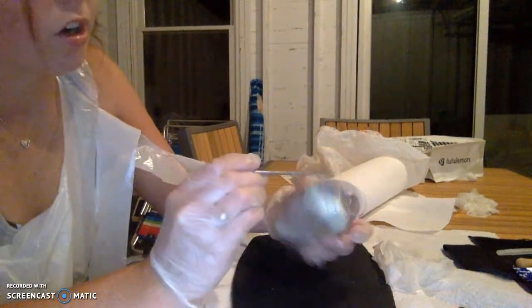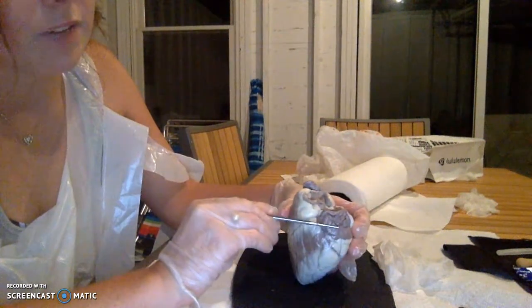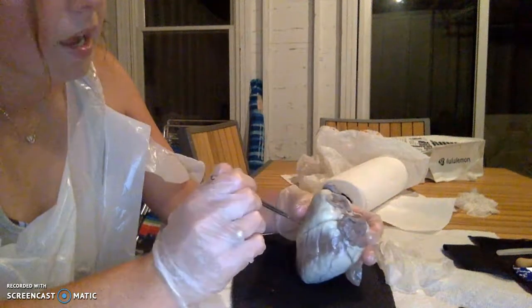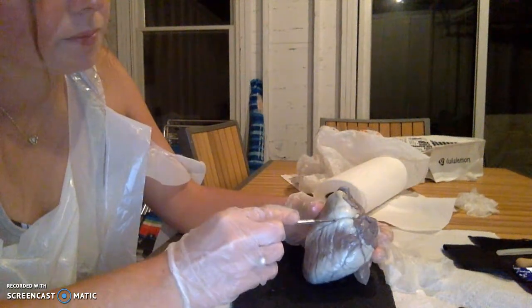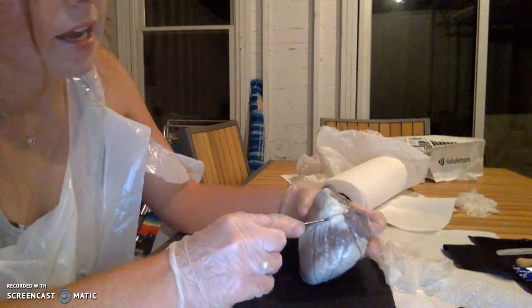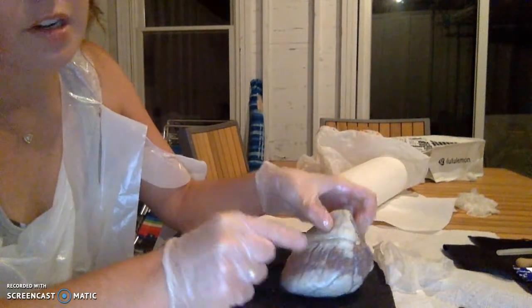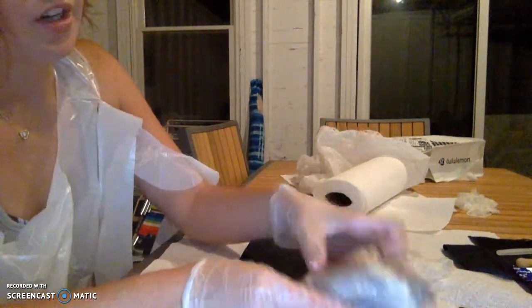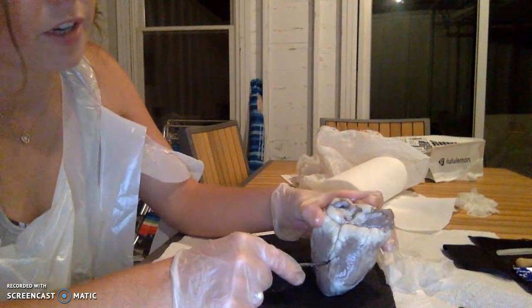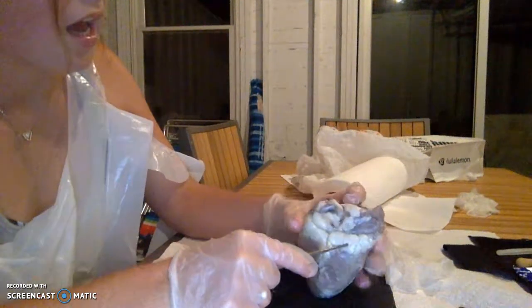And a little bit about, and here is the right auricle, here is the left auricle, the aorta is here, and the anterior interventricular sulcus is right here, and the posterior interventricular sulcus is right here. I apologize for getting mixed up with my words.